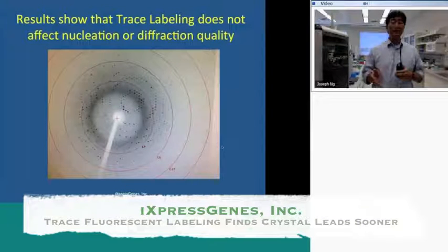Now, listen to me carefully. This is not lysozyme. Everyone's showing model proteins. This is not concanavalin or thaumatin. This is actually one of our structural genomics proteins. This happens to be the inorganic pyrophosphatase that we've been studying for a number of reasons, for X-ray and neutron, and we've gone through a lot of searches.